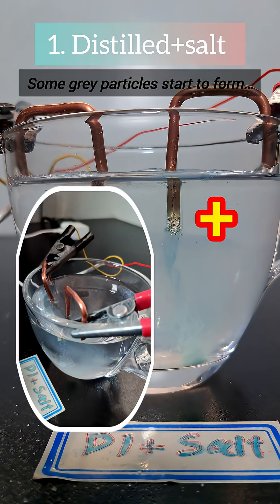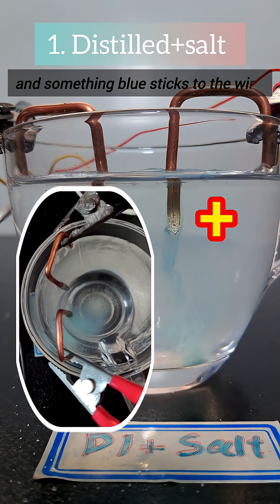Some grey particles start to form, and something blue sticks to the wire.